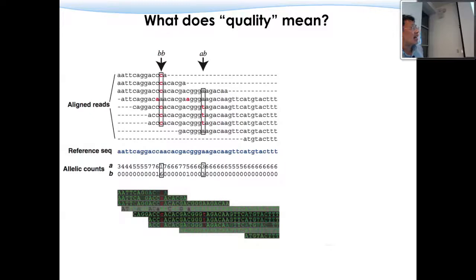You can see that for this one, you got the reference genome here, and then you got the sequence aligned in these regions, and each individual read here is represented by different colors, and those colors indicate the quality of each individual nucleotide.